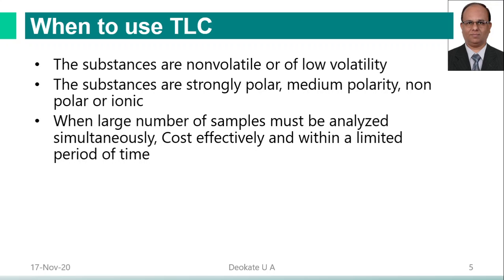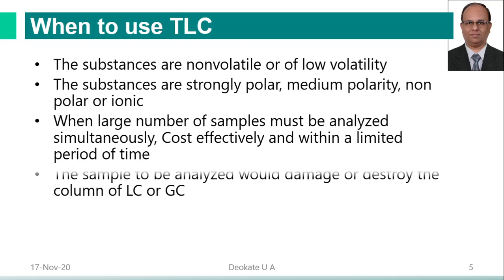It is used when a large number of samples must be analyzed simultaneously. It is cost effective, and within a limited period of time we can complete the analysis, because at a time we can spot all the samples together and run the chromatogram, and within a small period we will get all determinations simultaneously.